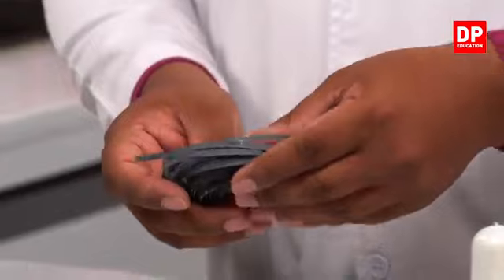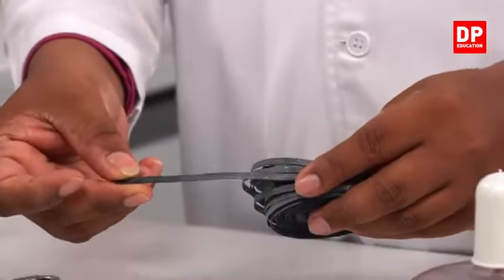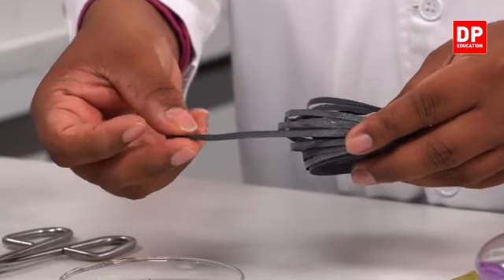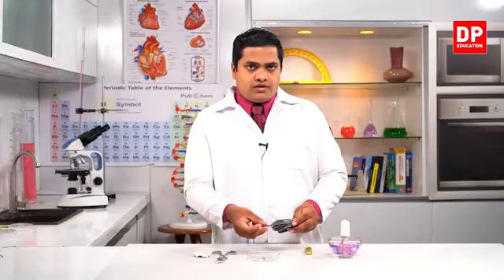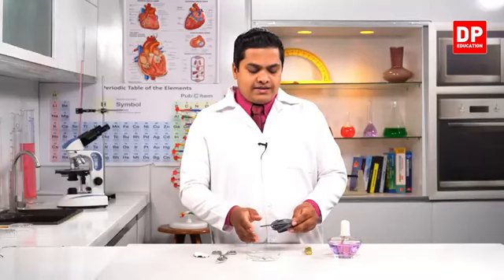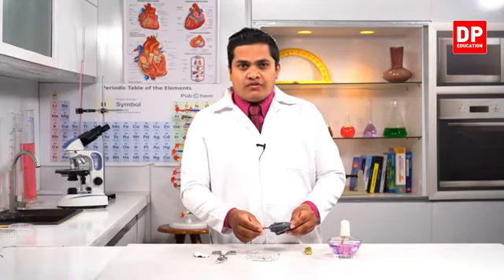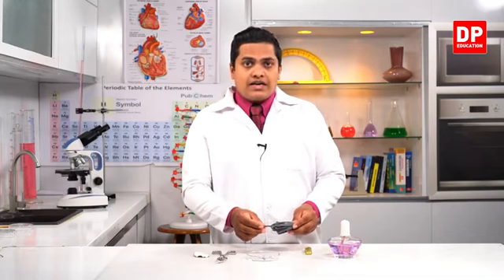This ribbon is called magnesium. Even though it is a metal, you can see that it doesn't have any luster. Luster means a shiny surface, right? It's because magnesium is covered by an oxide layer. Magnesium bonds with oxygen in our atmosphere, and an oxide layer can be observed around magnesium.